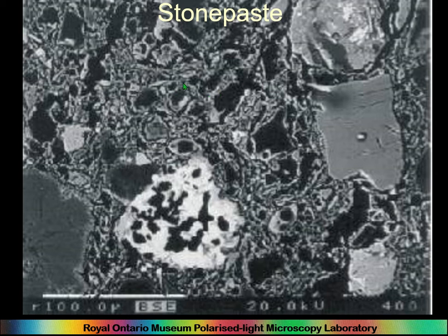I have no idea why they added glass to pottery. It sounds like it might be a good idea, maybe make the body more vitreous, but it doesn't seem a lot to have come out and gone into the body. But adding glass is an important aspect of this technology.